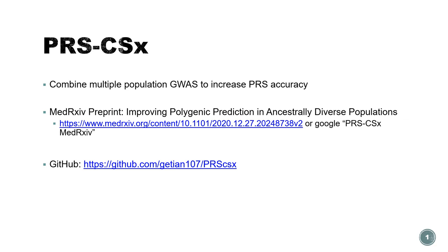Our GitHub has a very detailed README that covers almost all the aspects of how to run PRS-CSx. If you are familiar with Python, you may figure out how to run it within no time yourself. Here, I will walk you through the whole process and clarify some details in addition to the README.